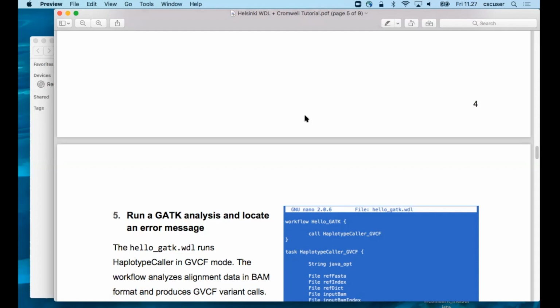All right. So slightly more interesting, but if you have a scatter, if you have multiple connecting chained workflow calls, it gives you a nice graphical way of validating it. It's also a nice way to share workflows. Versus giving someone a WDL, you can show them this, and it's a lot more intuitive to understand what's going on versus trying to parse the WDL yourself.